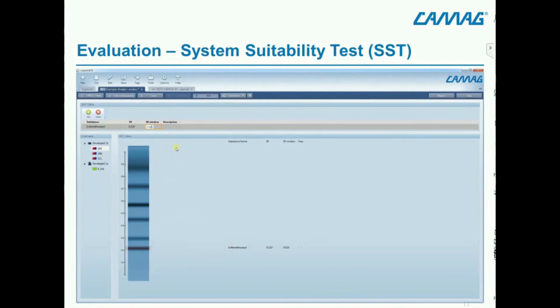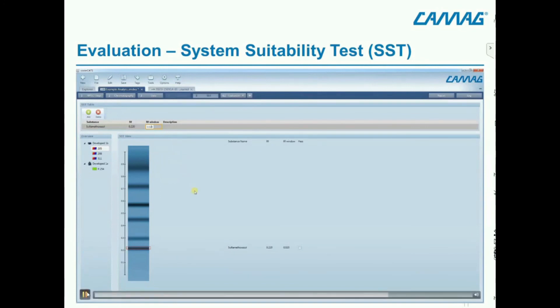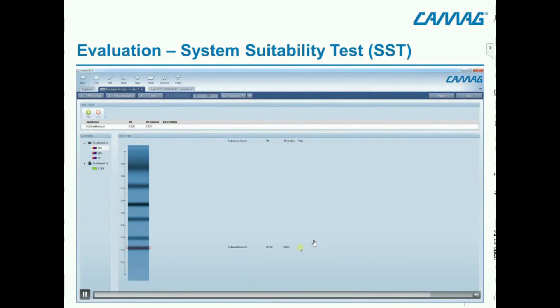Regarding export: the chromatogram itself cannot be exported directly, but you can export a report or the peak table. We will see the report export later. If the SST passes, you click 'OK' and this will be documented in the report.